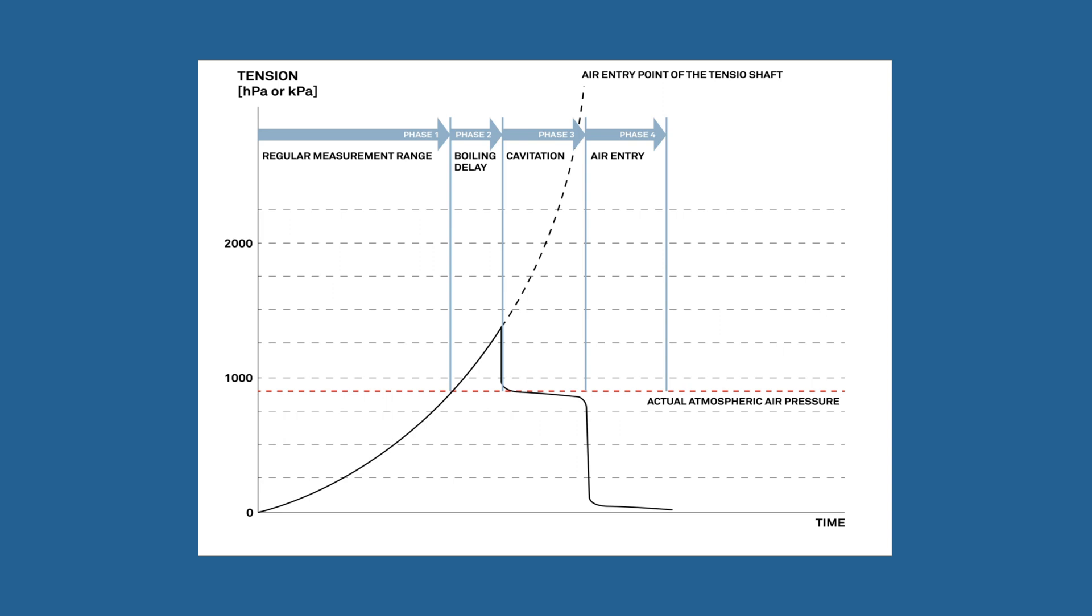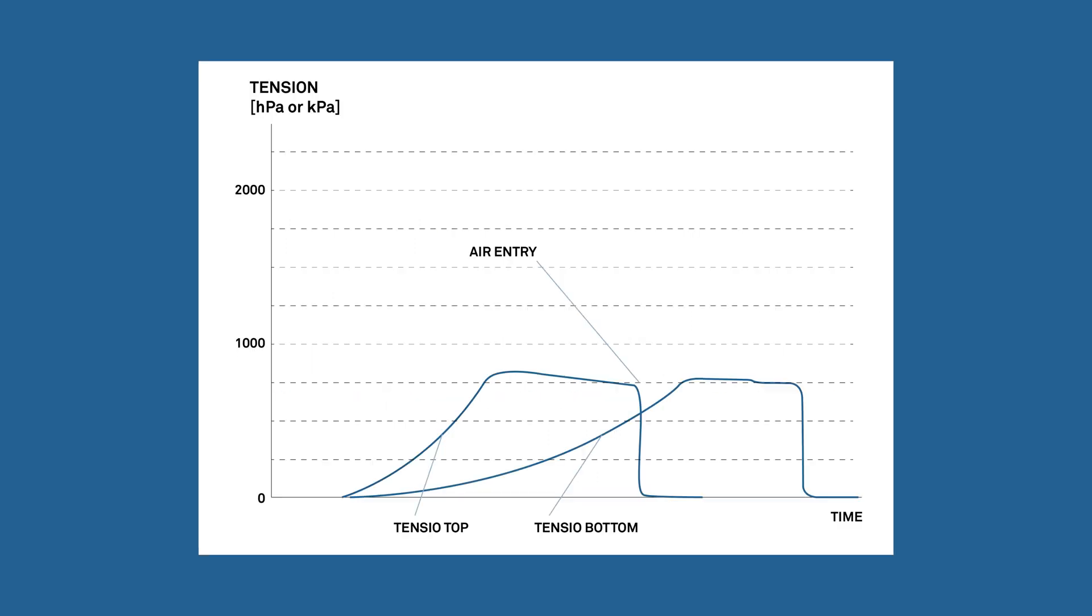Note that often the optimal measuring curve up to the boiling delay cannot be achieved. If this happens, the curves then look similar to this example. But even these curves can be used for evaluation. Refer to the manual for exemplary measuring curves of various soils.